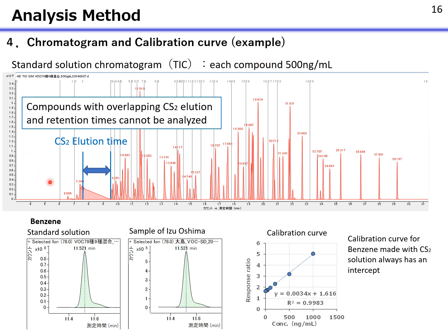Note that the retention time from 7.6 minutes to 9.5 minutes is the time during which carbon disulfide used as extraction solvent is eluting and the ion source is turned off during this time. Therefore, VOCs eluting during this retention time cannot be measured under those conditions.